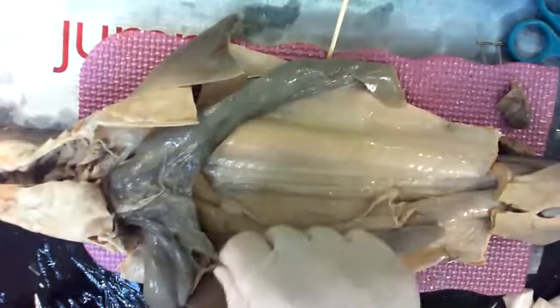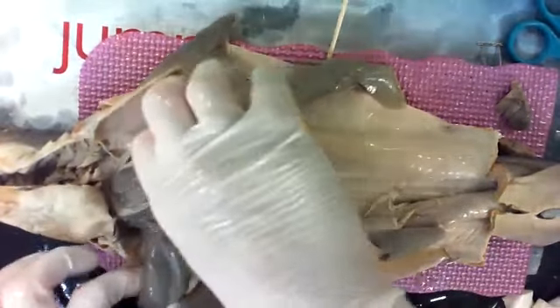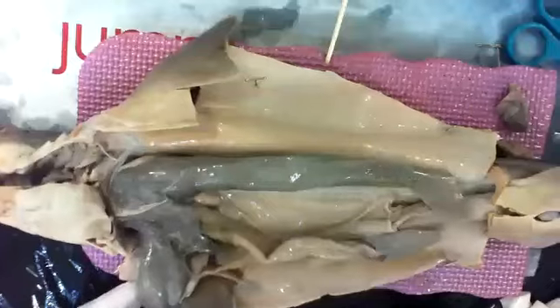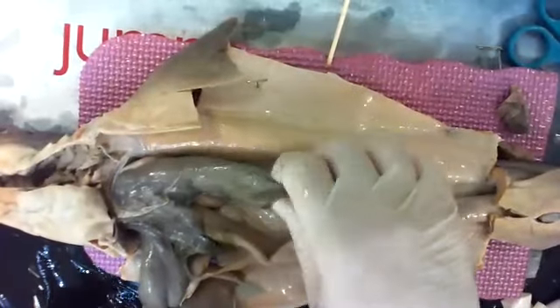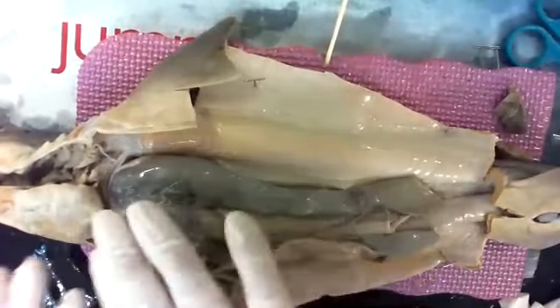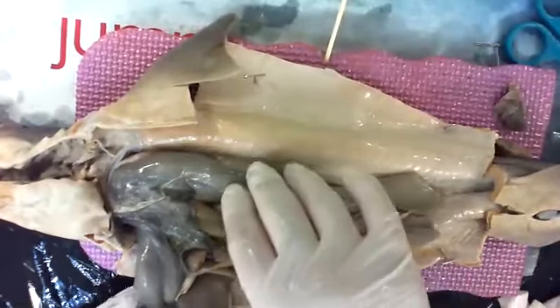So this little organ is called the gallbladder, and it makes bile. Here's the liver. Liver does lots of things. Liver cleans up toxins. So if you eat food that's full of bacteria and germs and chemicals that are bad for you, your liver will clean those out and get rid of them for you. Push it back into the GI tract and dispose of it.